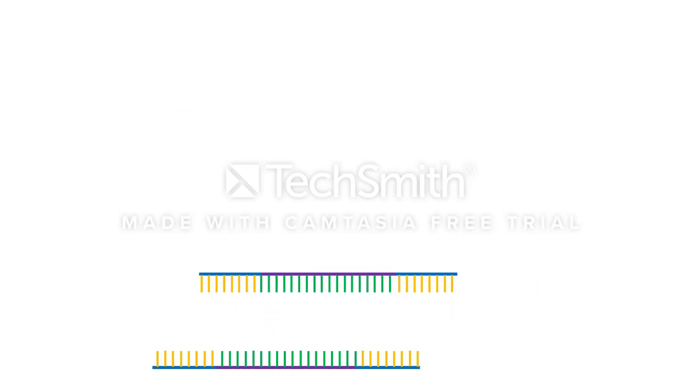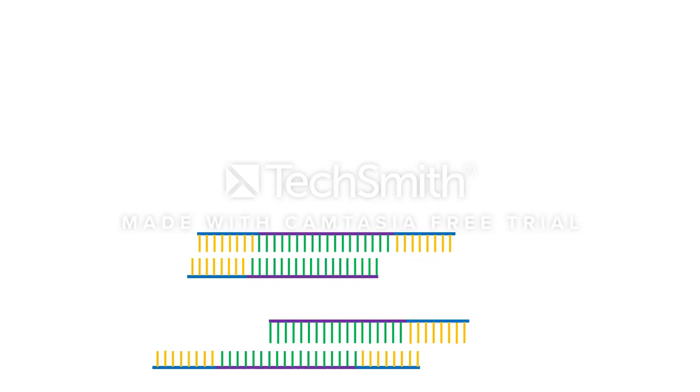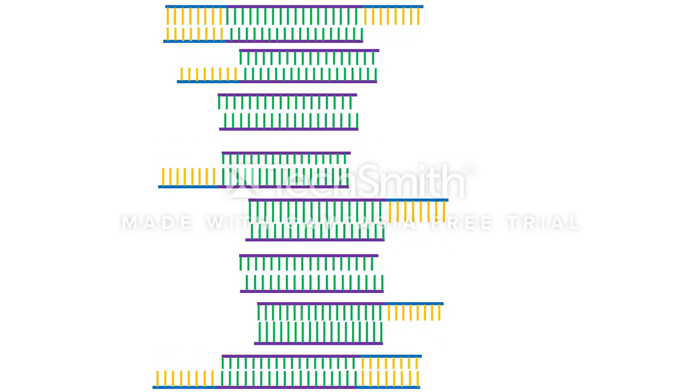This process is completed in a cycling process to eventually obtain your target sequence. As you can see, after completing about 3 to 4 cycles, you already have your desired product. qPCR utilizes this same process, but incorporates fluorescence in order to effectively quantitate the amount of product that would result.